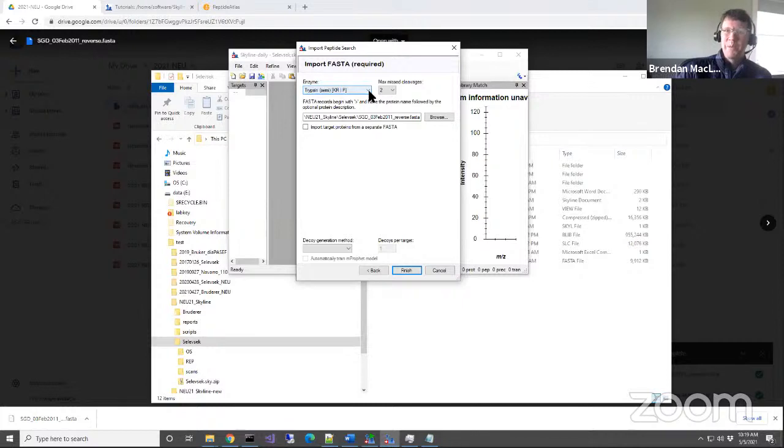You're going to get maybe 10 to 20% more peptides to search for. At this point, trying for the teachable, we're not going to totally try to mirror the paper, but you could. I made it possible, and I've tried it. This option was added based on reading that paper. I was like, whoops, we've got to make semi-trypsin available.